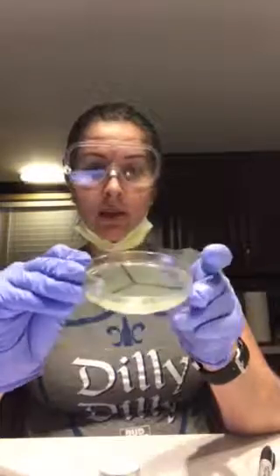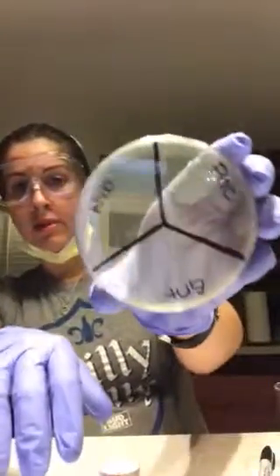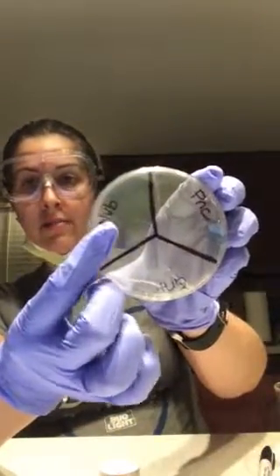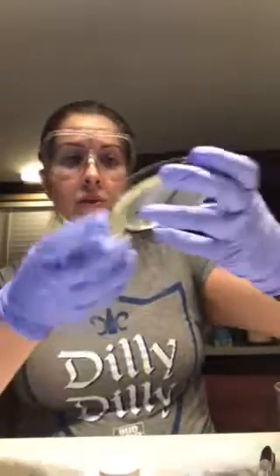I just finished pouring my agar plate about an hour ago so it's already been set. This is the large agar plate. I've already went ahead and drew on the bottom of the agar plate so we have the penicillin, the novobiocin, and then gentamicin. We are separating these because once we add the S. epidermidis broth to the petri dish, we're gonna use the antibiotics to see what happens when we add the bacteria along with the antibiotic.